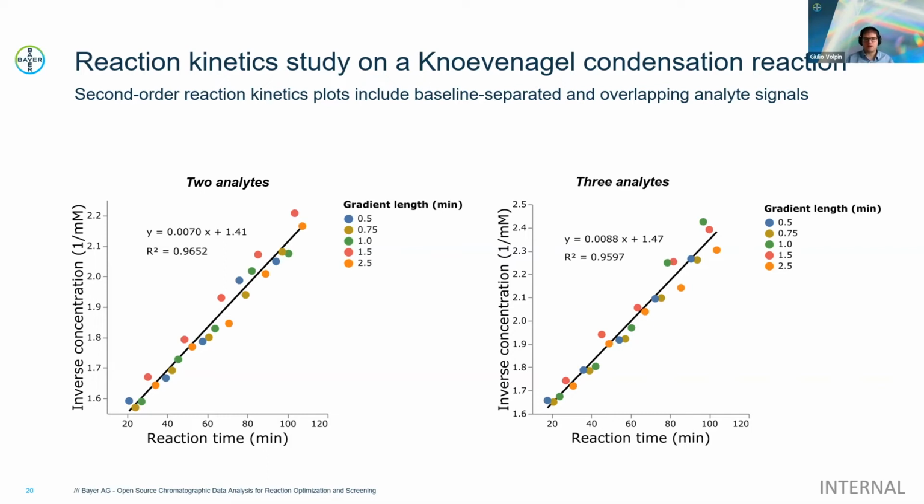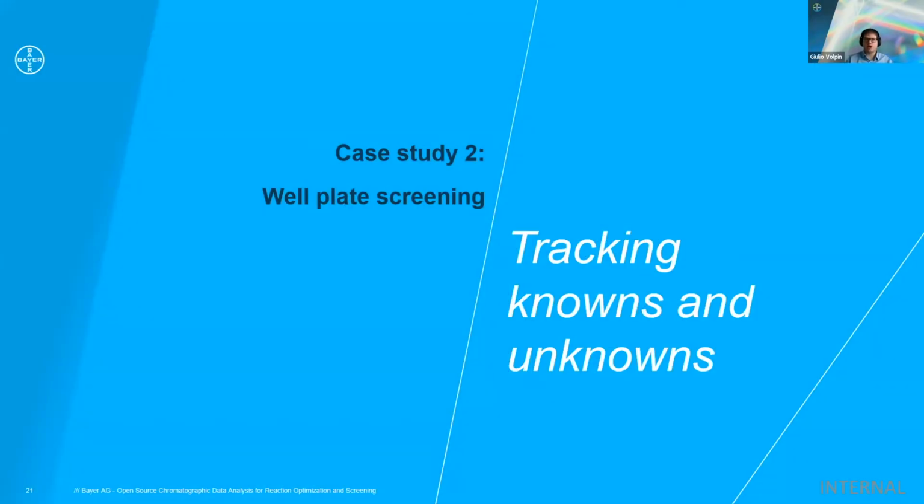for this specific problem. Then we went one step further, having proven that we can validate peak deconvolution and deal with unexpected compounds that may overlap with our desired peaks. And we set out to study a Wellplate reaction that we were interested in and analyze it with MOCCA.